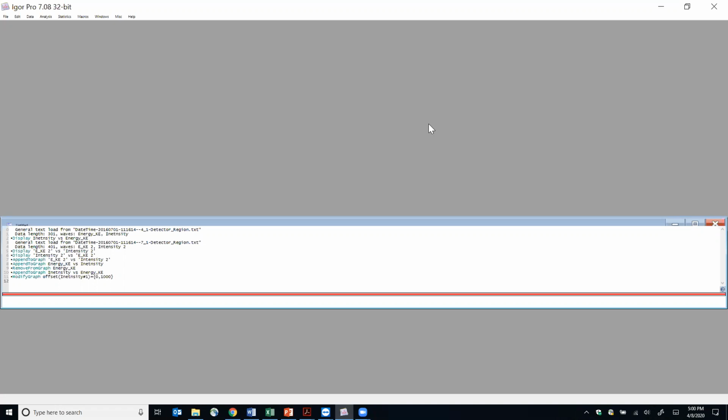So, do you know anything about Igor? Did you try to plot anything? Well, what I know is just plotting the graph and then changing variables and parameters that I want to look at. Oh, okay, this is actually very similar to all that I need for your work.